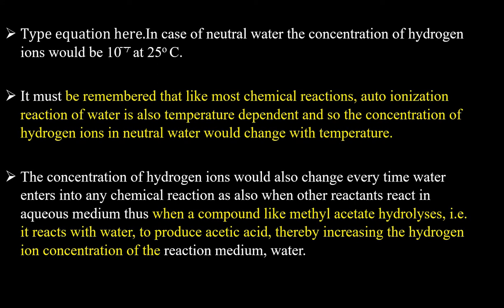It must be remembered that, like most chemical reactions, the auto-ionization reaction of water is also temperature dependent. So the concentration of hydrogen ions in neutral water would change with the temperature. The concentration of hydrogen ions would also change every time water enters into a chemical reaction, as also when other reactants react in an aqueous medium.